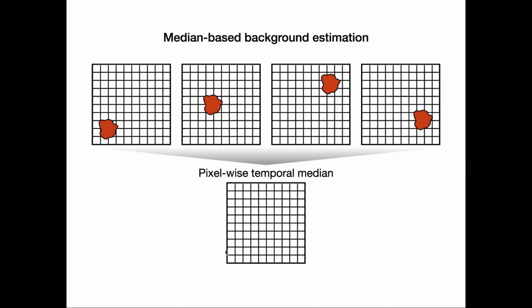Now you can circumvent this problem if you apply a completely different background estimation procedure. What you need to do is basically determine the background without any of the moving particles. If a particle moves along during a frame sequence, and you look at one particular spot, for example this here, then you will notice that the signal intensity during most of the frames will not contain the particle.